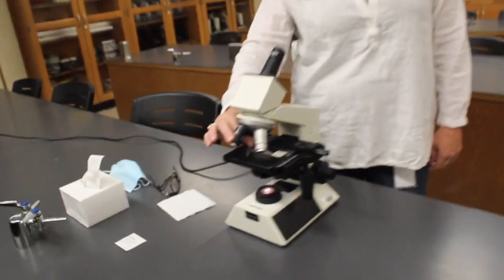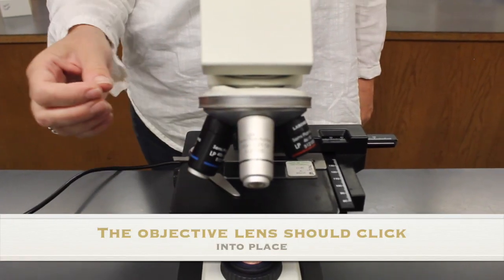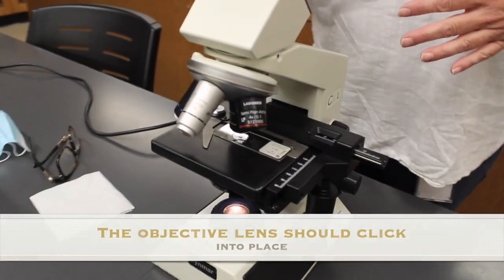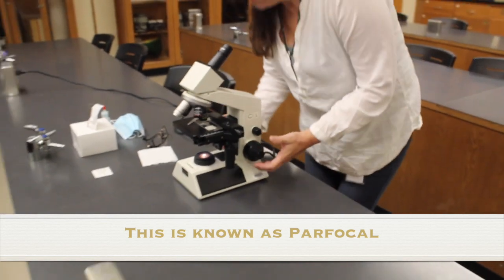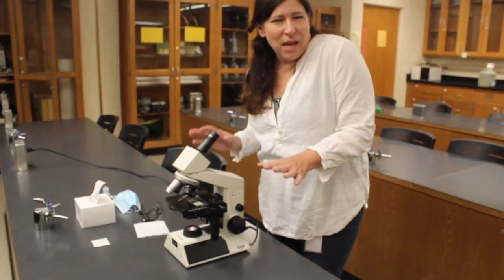The next thing that we're going to do is to zoom in. And to zoom in, we simply move our lenses to the next highest power. This is called medium power, also 10x. And at this time, when I look into the microscope, it should be mostly in focus. So I'm going to take a peek in here. I can see the letter E, but it's not in great focus.